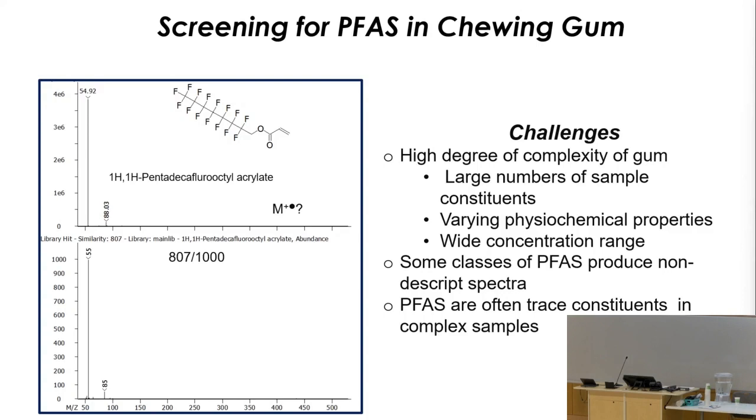And by the way, I put that slide up. This is the same sample analyzed using the BTX. I also had false positives using the HRT. I said, well, yay, I have found the PFAS. Not really. I don't know if you would be confident in this number here. I don't know, 800?